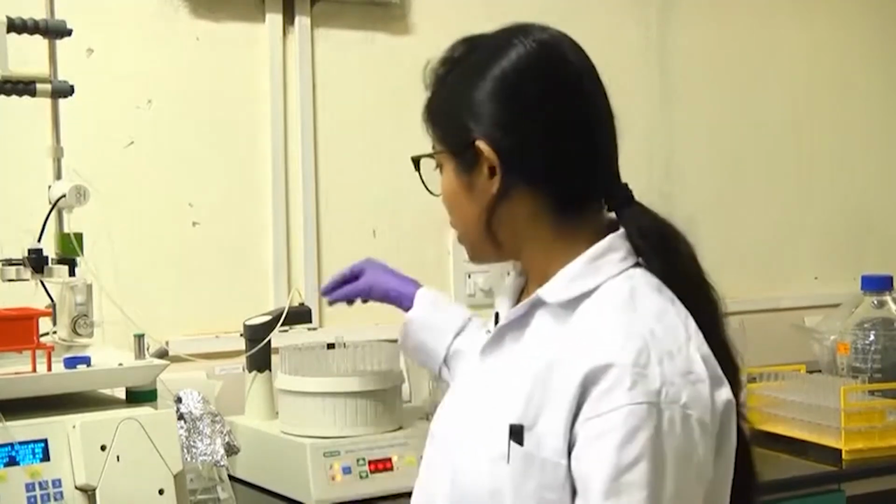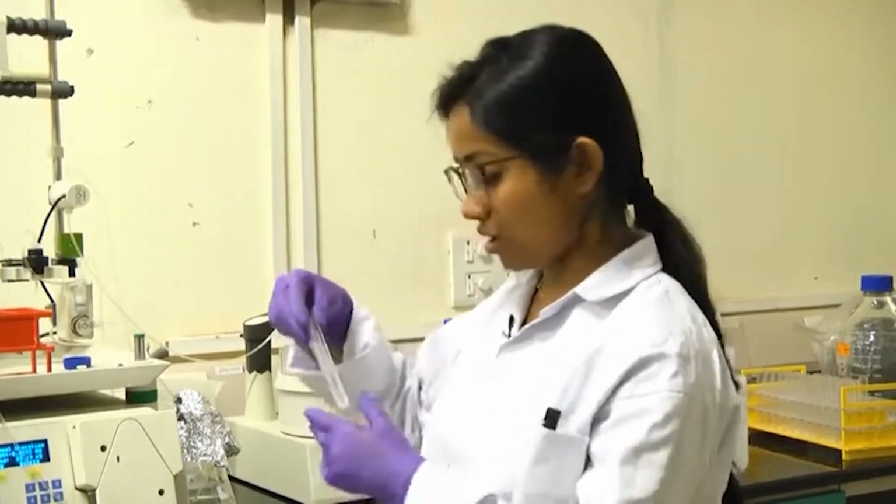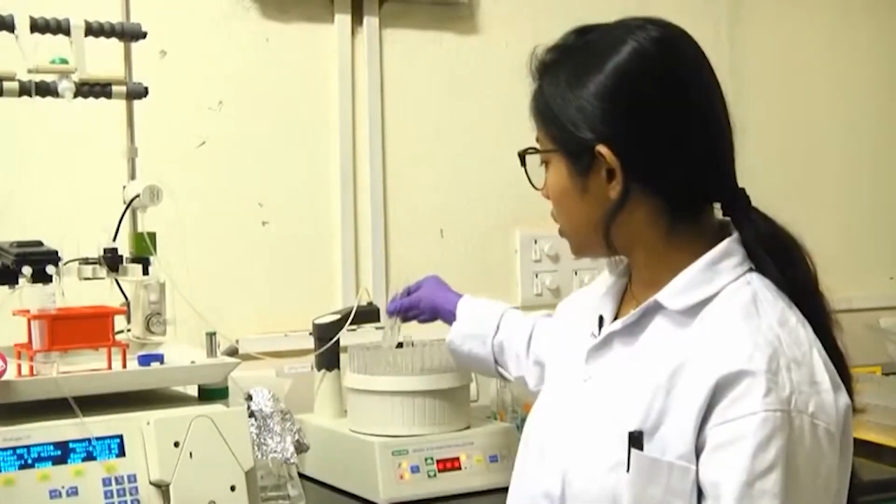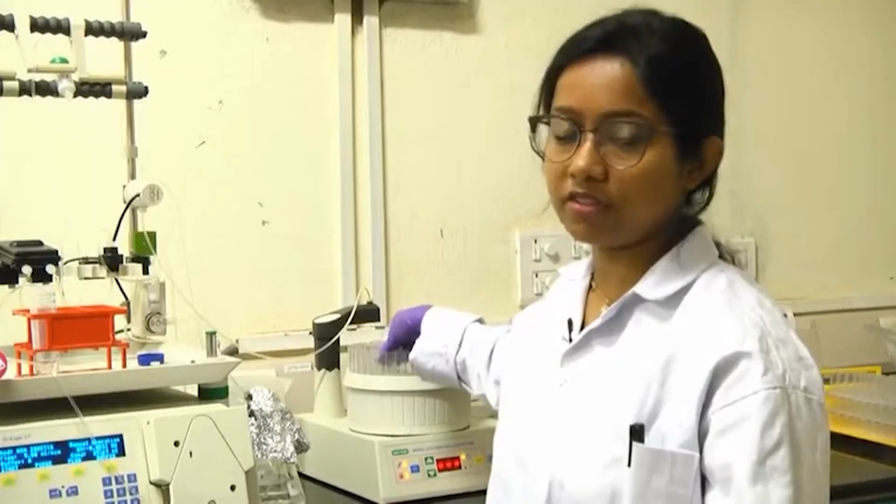Right now our job is to run the SDS PAGE. Through SDS gel electrophoresis, we can see the purity of our protein. We will take a small amount of this fraction, or we can concentrate it down and take that solution, and run it through SDS PAGE to check whether other contaminant proteins are there. We will probably run a 12% or 15% SDS PAGE, and we will also check the quantity of the protein, how much protein we have, using a NanoDrop.